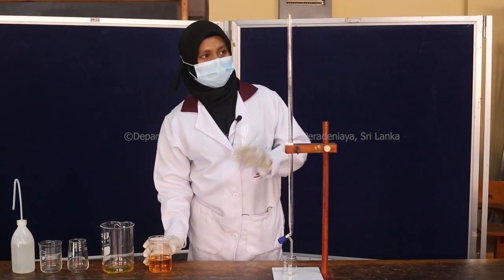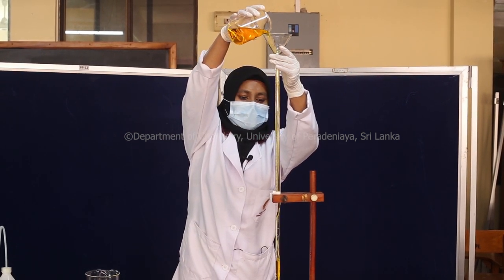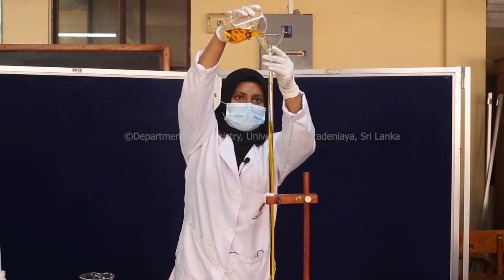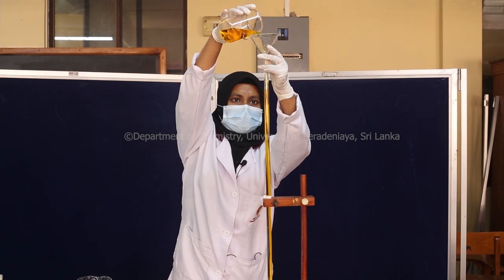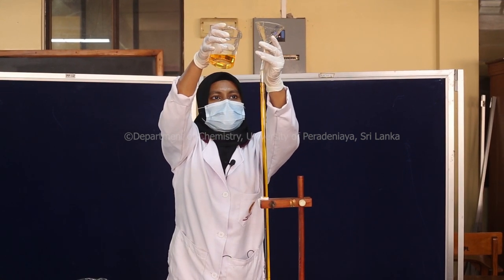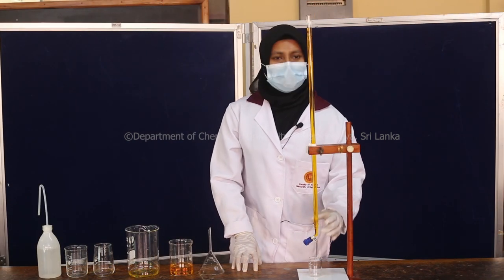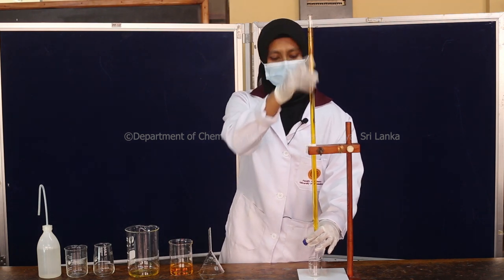After making sure that the tap is closed, fill the solution using a funnel into the burette. Make sure to add a little excess of the solution so that the meniscus is a little above the zero mark. Then open up the burette tap slowly and let the excess solution out, making the meniscus align with the zero mark.